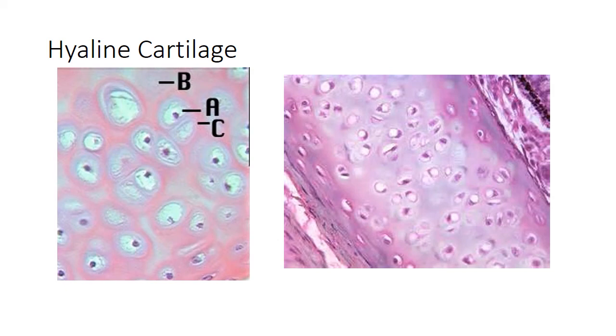Hyaline cartilage. Hyaline cartilage, remember, this is kind of like the most common cartilage found in the human body. Where do you find this? Rings of your trachea, but also find it within your joints. It's called articular cartilage. Once again, you got this thing called a chondromucoprotein, a matrix in between. And then, see the little cartilaginous cells? What were the name of the cartilaginous cells? What were they? Come on. Anybody? Chondrocytes. What's the name of the chamber they're stored in? Lacuna. There we are.